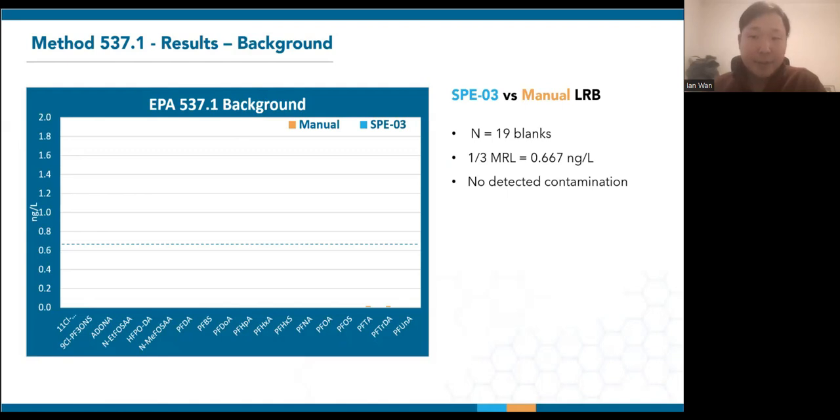The plot shows the average lab reagent blank (LRB) measurements across 19 field extractions. All 19 LRBs on the SPE03 had undetectable levels, while there was a small trace of PFTDA and PFTRDA on one of the manual extractions. Undetectable would be in the noise range of much less than 0.1 nanograms per liter for this lab. Now with SCIEX triple quads achieving PPQ detection limits, we may soon get an even more precise look at these levels.